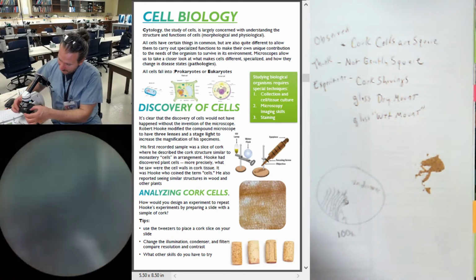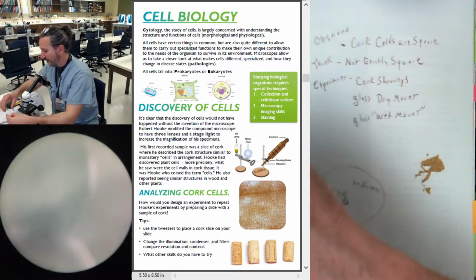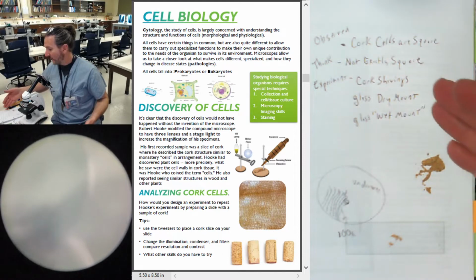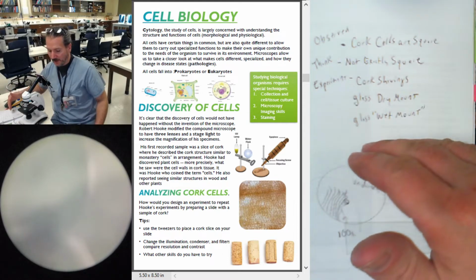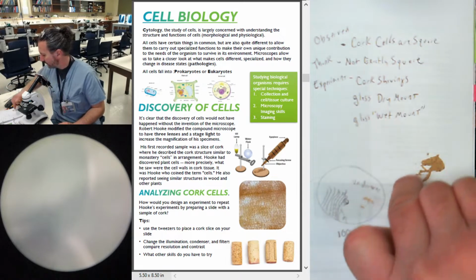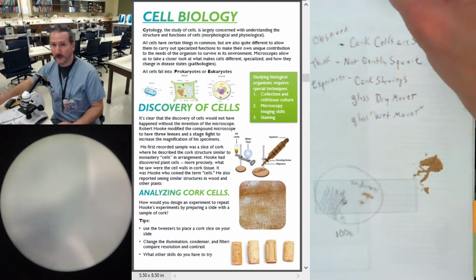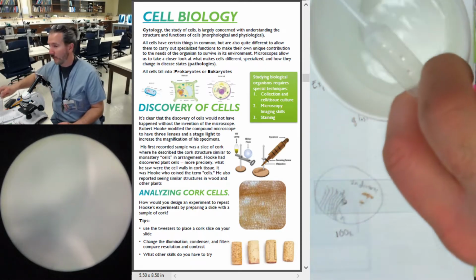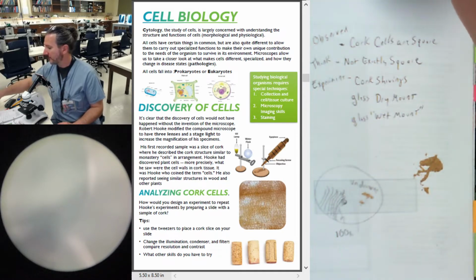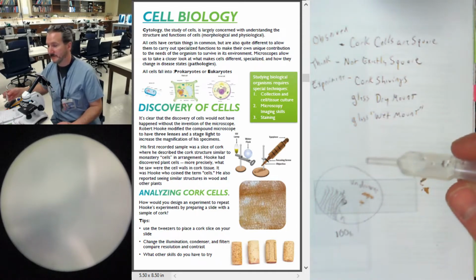I'm going to bring this out. And then I put this here so that you could see it. But you can always flip to the next page, and the next page talks about wet mount. So with a wet mount, I'm going to take a cup of water. There's my eyedropper. I'm going to put some water in the eyedropper. So I'm going to squeeze the eyedropper, suck the water in. Have a few drops there.